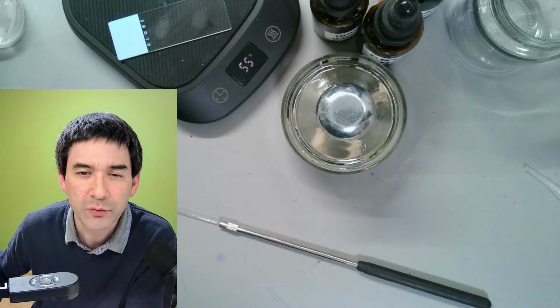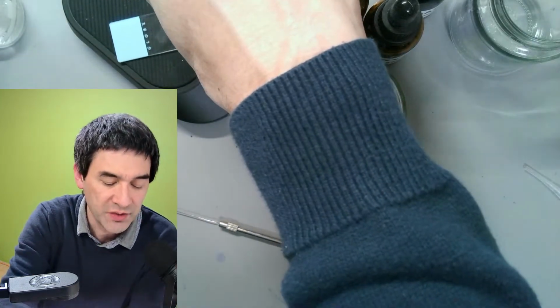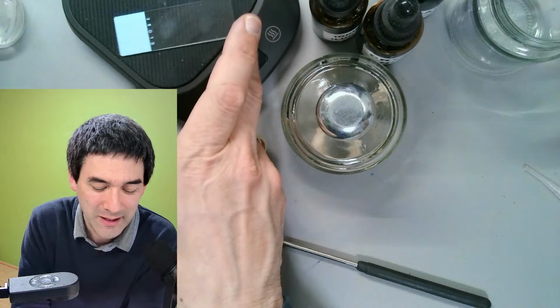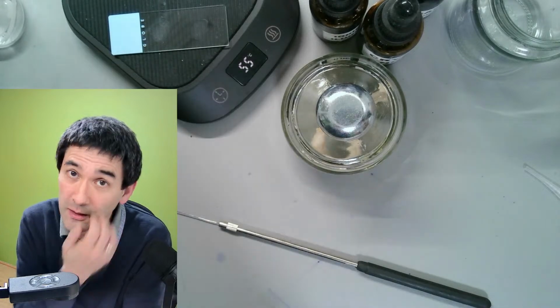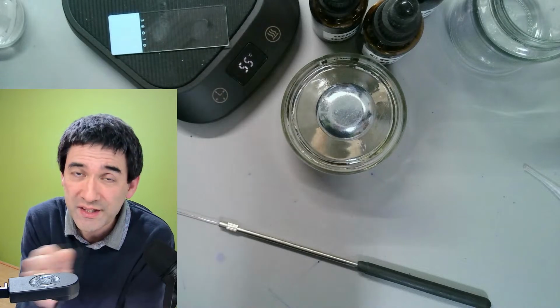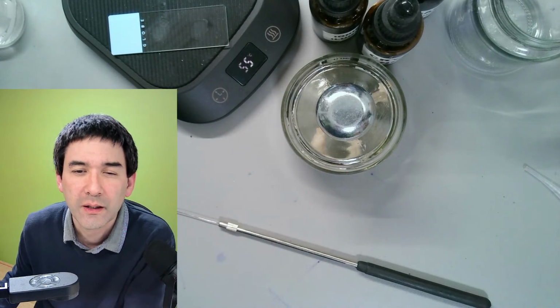Can you stain different gram bacteria at the same time on the same slide? Yes, this is actually what I have done right now, simply because I was lazy. Not only because I was lazy to switch slides, but simply because it's later on easier then to observe it under the microscope, because I just move over and then I can actually see both of them next to each other.